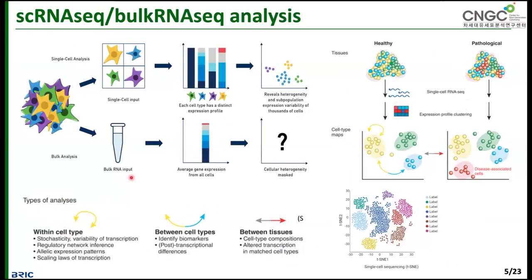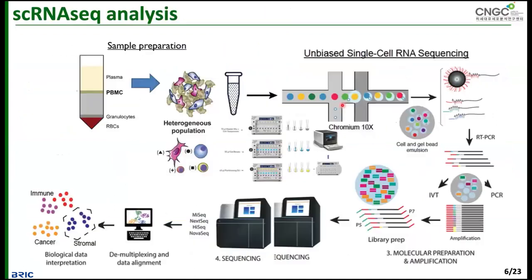If you have any doubt, maybe at the end of my presentation, you can ask me, and let me explain in more detail. And this is the method of how we perform the single cell RNA sequencing experimental part. This experiment takes 3 to 5 days or more. It depends on the sample you choose or the objective or kit you choose.